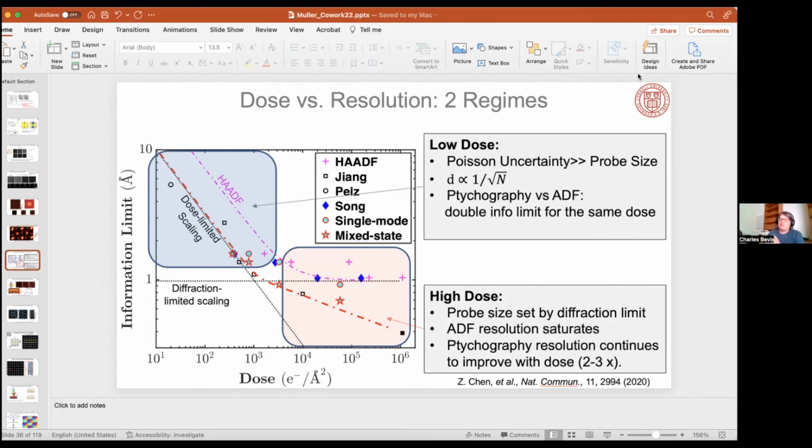Thanks. Wonderful talk. Thank you so much. My background is more in X-ray UV ptychography, so I'm unfamiliar with the electron side. I know there are a lot of different tricks you can play with ptychography, with the multi-mode relaxations. One that I've seen and played around with a bit is masking the diffraction pattern to block out, say, a saturated region of your detector. It sounded like one of the big problems you were working on with your detector was increasing the dynamic range. So I was wondering if you've played around with this sort of relaxation where you mask out part of the DC, to limit the dynamic range required by the detector. I'm sure you're then throwing away the DC of the diffraction pattern, so you're losing information, but I'm just curious if you played with it at all.